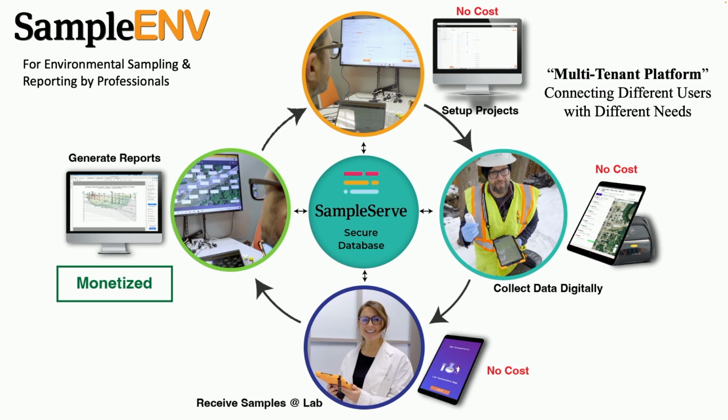You'll notice that the first three parts of this platform show no cost. Our business model is to give away the data collection and lab components of the platform at no cost. We only charge for the optional report generation components. Users have to opt into the report generation component of the platform, which we only bill per sample. Everything else is free. It's not just a free trial, it's free forever.